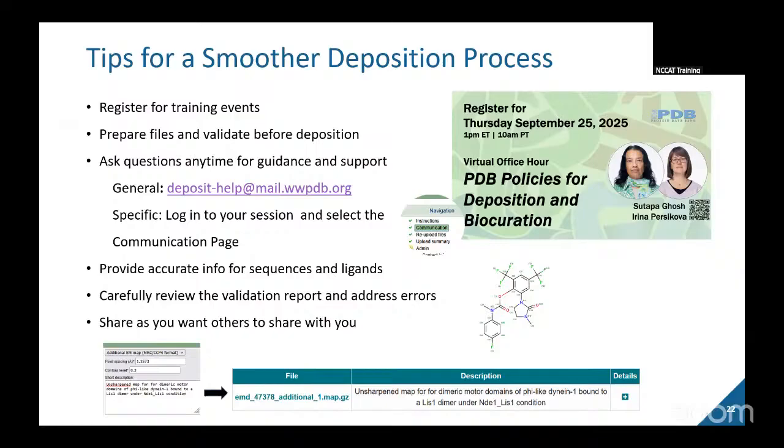Yeah, it's difficult, and we're probably seeing a bit of a fracture there, some splintering even, from the fact that it's really designed and optimized for single model representation and a very simplistic path forward in how you produce a model. So I think these composite entries are really banging at the door now, showing us that we have to be more sophisticated and really make sure the data is linked together and that this information is something people would use and not just a requirement that's put on people. So, yeah, this is a good point.